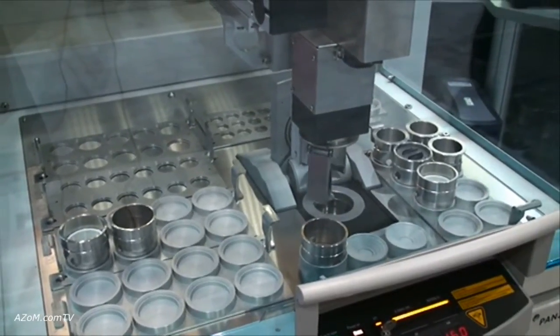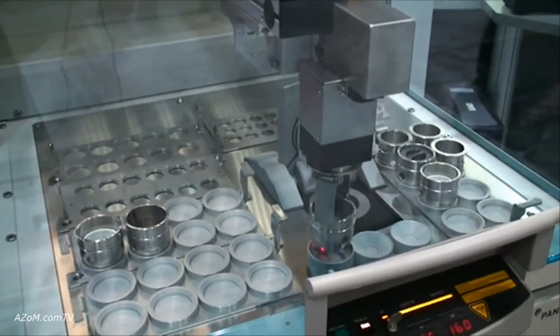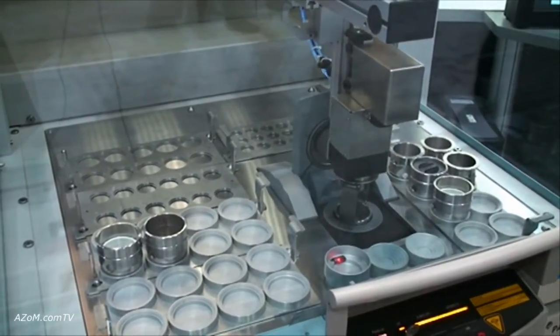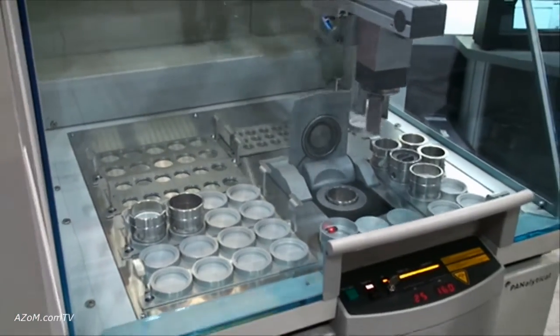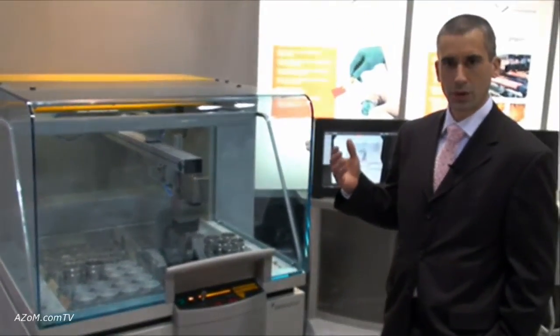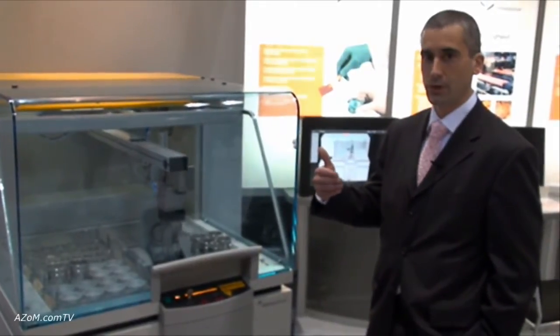One of the special features we're highlighting here at the show is the X-ray tube — the main source for the system — which is our SST Max X-ray tube. It incorporates zero drift X-ray tube technology that's unique to us, and the system limits the drift that's typically encountered from deposition of filament material inside the X-ray tube, which decreases light element sensitivity of the instrument over time.